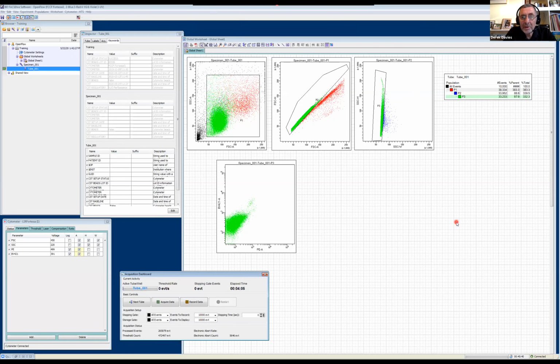No, I was going to say I would completely agree with that. Becoming intimate with your data is very important. Yes. And plot everything against everything else, because sometimes you see patterns in one plot that you might not see in another. Exactly.